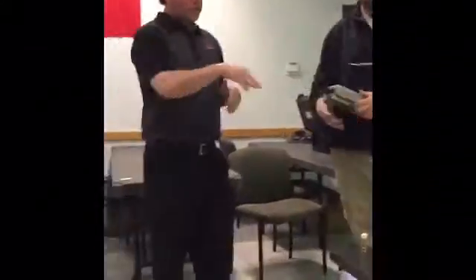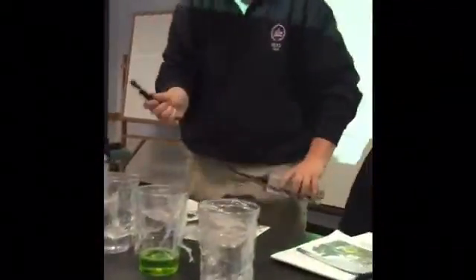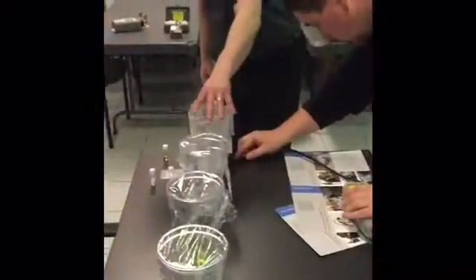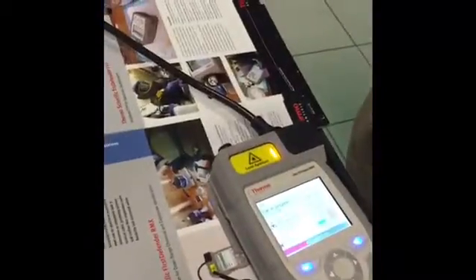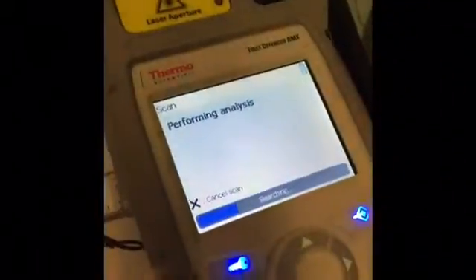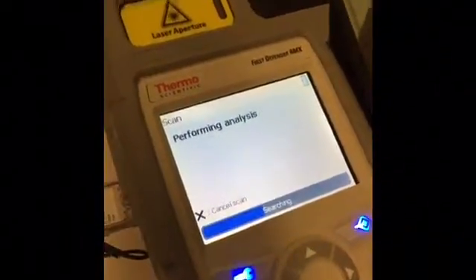Let's go ahead. Kyle, do you want to do one? Sure. You haven't done one yet. Position the probe right against the container and press it right up against it. Hit the top right blue button twice, then go left arrow to scan. We've got a lot of fluorescence — some yellow bars for fluorescence and only one bar of signal strength, but it's getting something. It's finished and now it's doing an analysis.